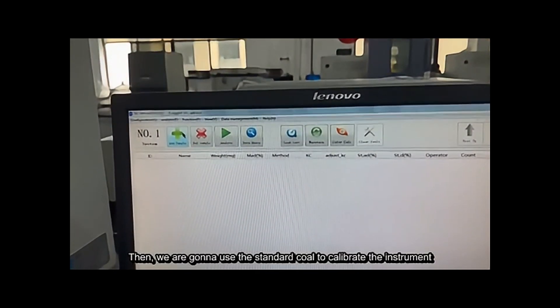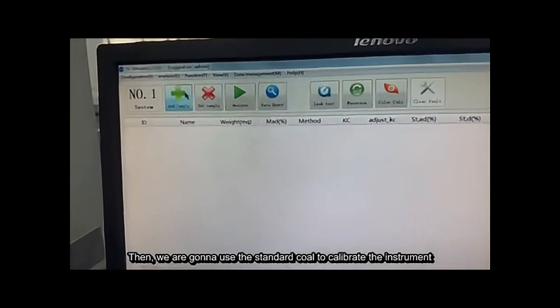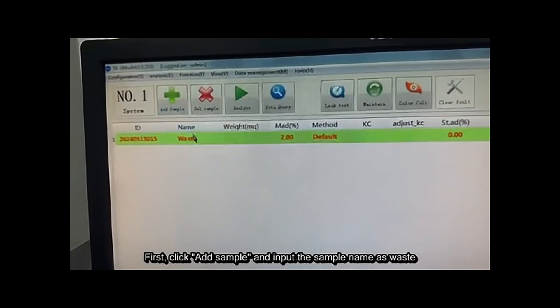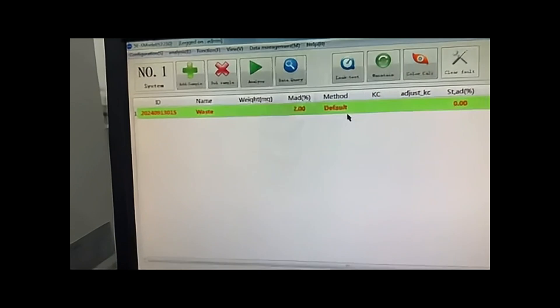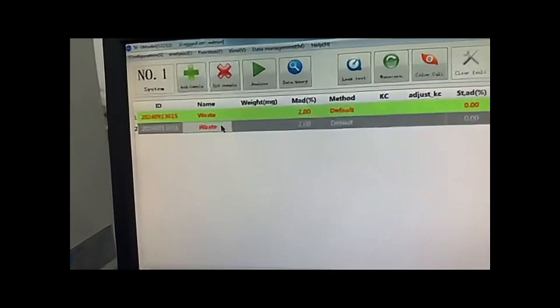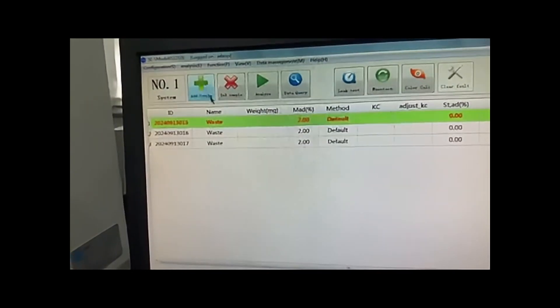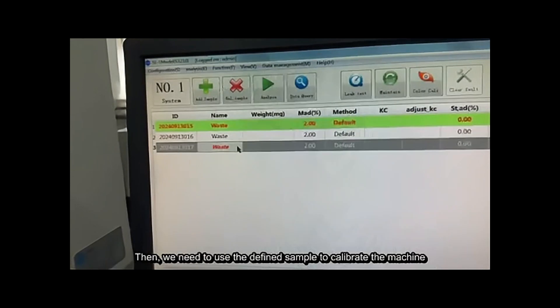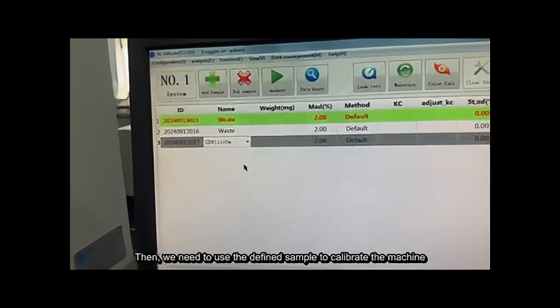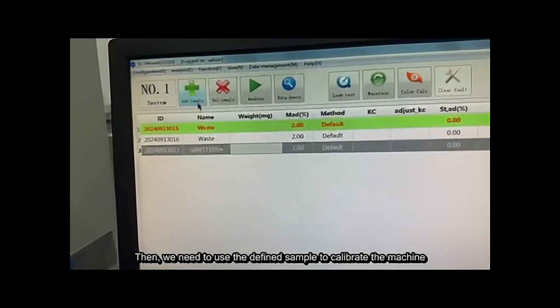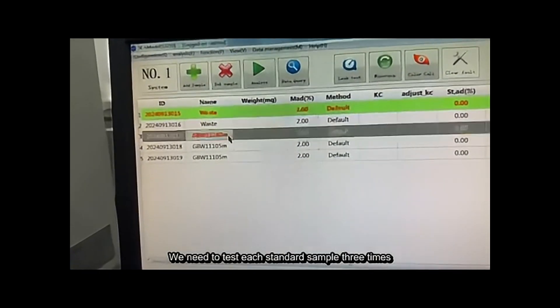Then we are going to use the standard coal to calibrate the instrument. First, click Add Sample and input the sample name as waste. We need to test two waste samples. Then we use the defined standard samples to calibrate the machine — each standard sample needs to be tested three times.